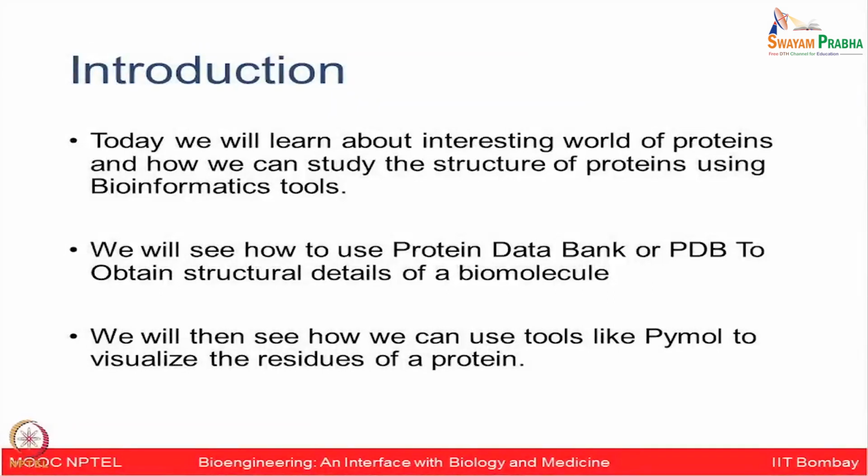Today we will learn about the interesting world of proteins and how we can study the structure of proteins using bioinformatic tools. We will see how to use the Protein Data Bank, or PDB, to obtain structural details of a biomolecule. We will then see how we can use tools like PyMol to visualize the residues of a given protein.